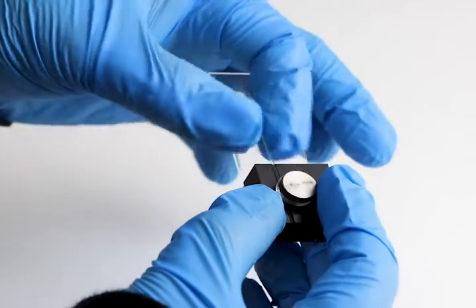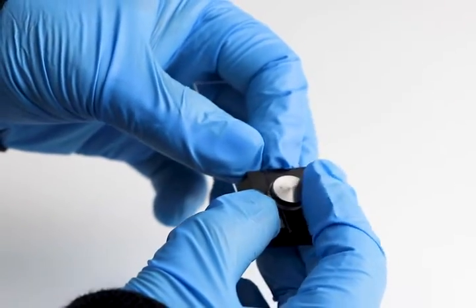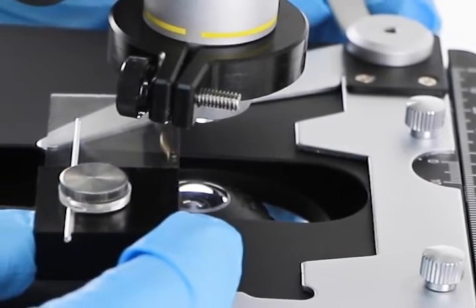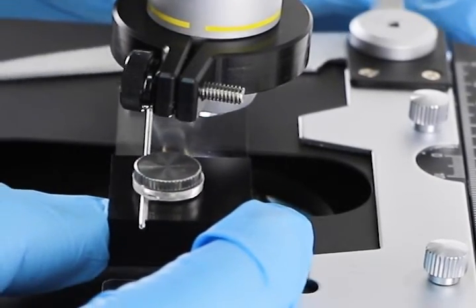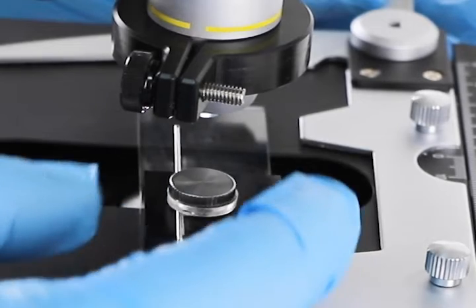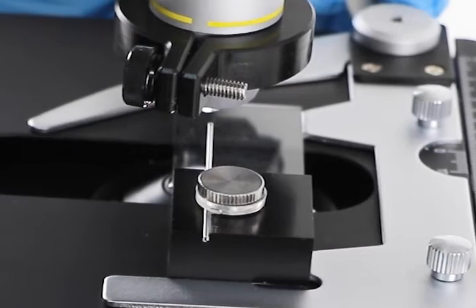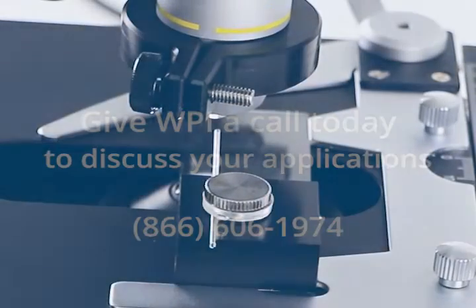Mount the pipette in its holder by sliding it into the groove and tightening the thumb screw. Then install the slide on the stage. Position it so that it is focused in the field of view close to the filament, but far enough from the tip of the micropipette that the filament's expansion will not allow it to touch the tip.